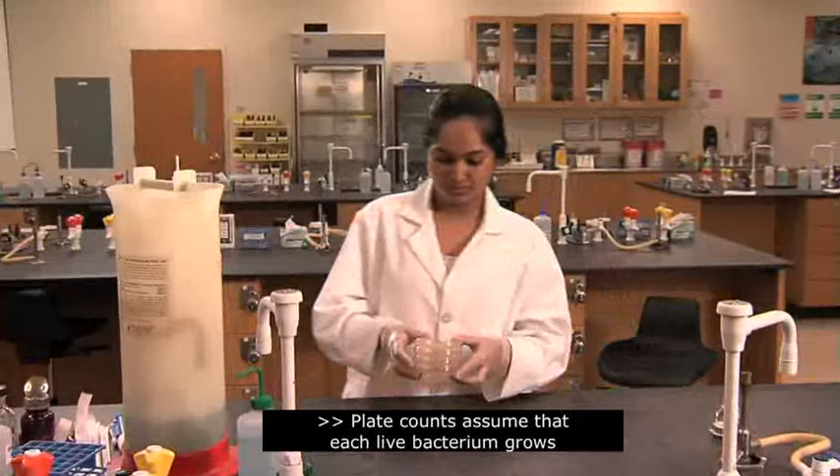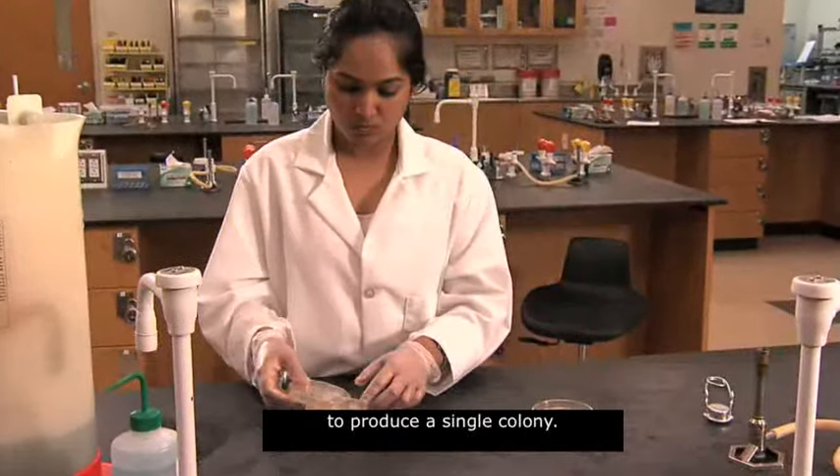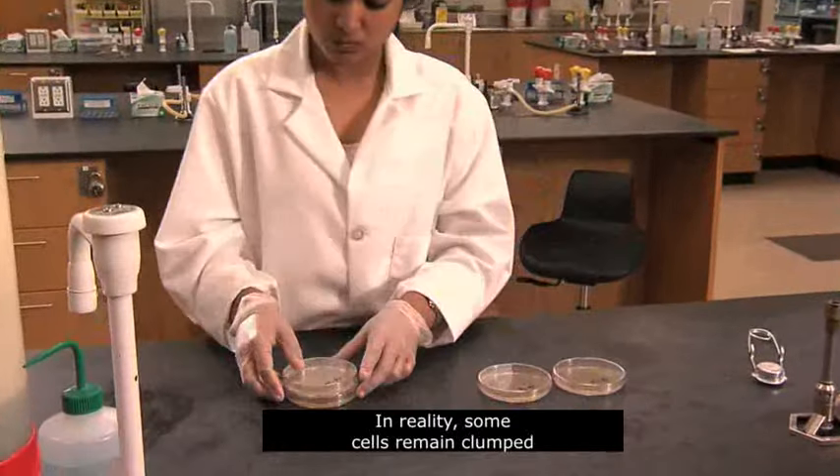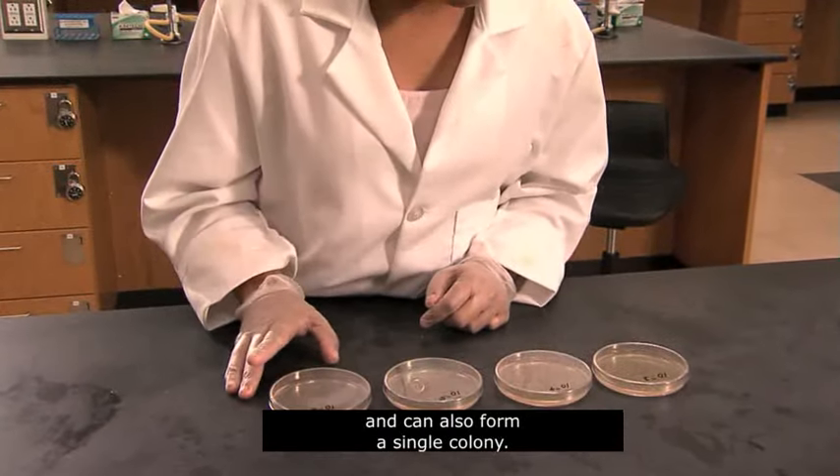Plate counts assume that each live bacterium grows to produce a single colony. In reality, some cells remain clumped and can also form a single colony. Therefore, results are reported as colony-forming units, or CFUs, per milliliter or gram of a sample, instead of cells per milliliter or gram.